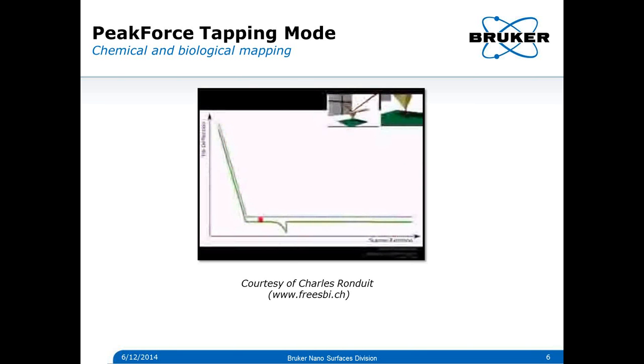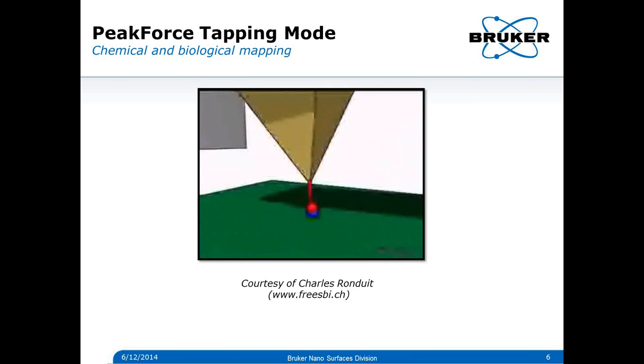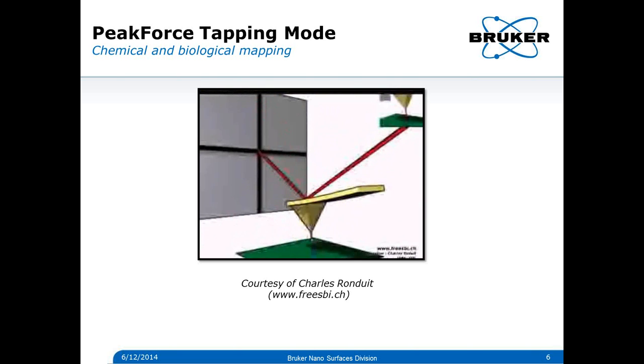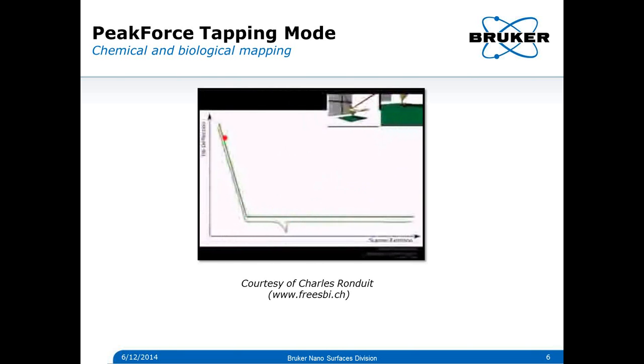can be measured. And when the tip is functionalized for molecular recognition measurements, one challenge becomes the ability to distinguish between non-specific interaction and specific interaction. For this reason, it is common to use intermediate molecules, also called spacers or linkers, between the tip and the molecule. The greater flexibility of the linker provides the ligand molecule some mobility to best assess the binding receptor.